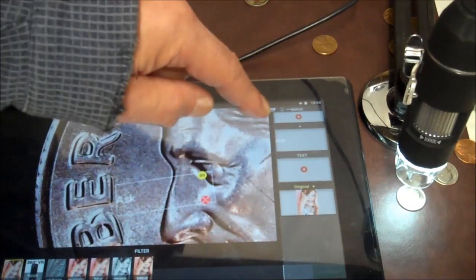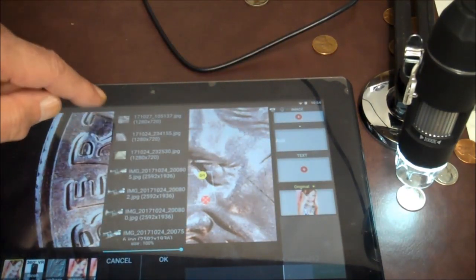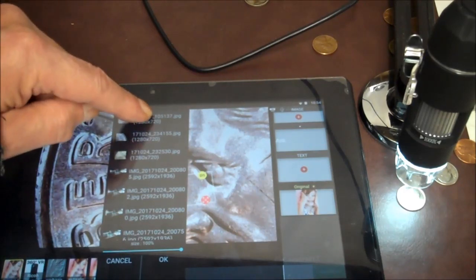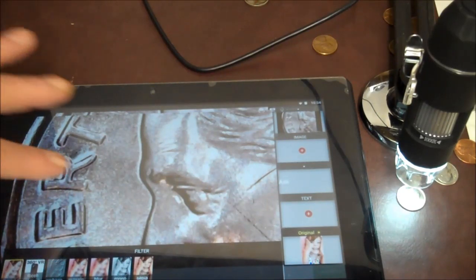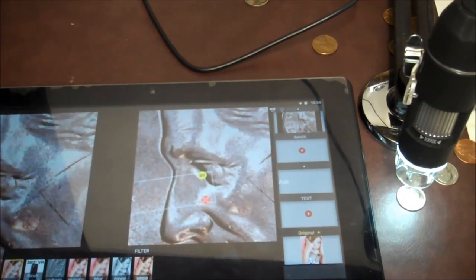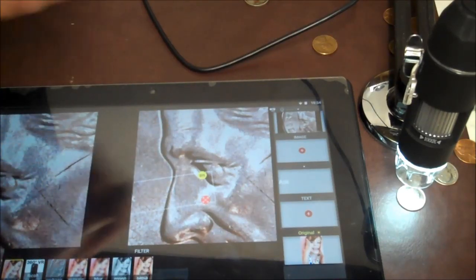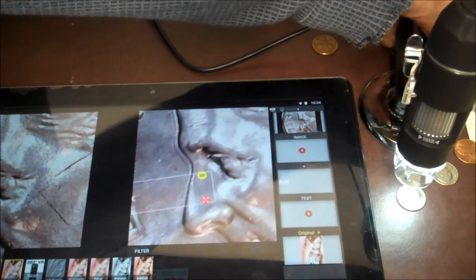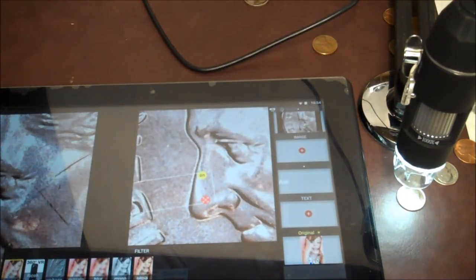Or you could add an image to your picture so you could compare something. So if I want to click that right there and tell it okay. It adds the picture over your magnifying. And so you could compare two different things on the screen. So anyway.